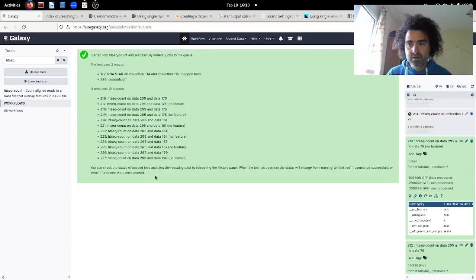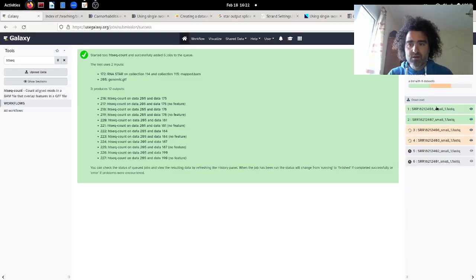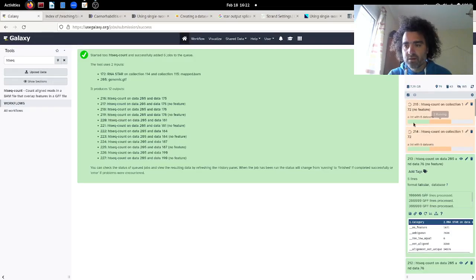Okay, things are there, and we have to wait. Okay, things go on here. Since I put a collection, I can see on the progress bar here that some HTSeq runs have been completed and some others are going on.